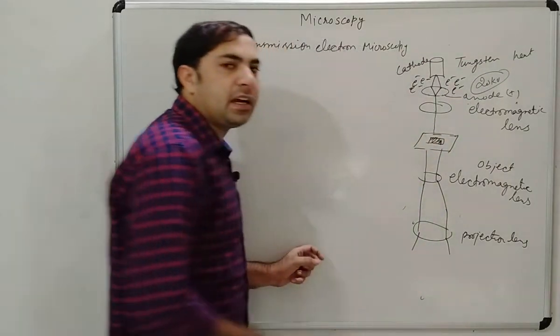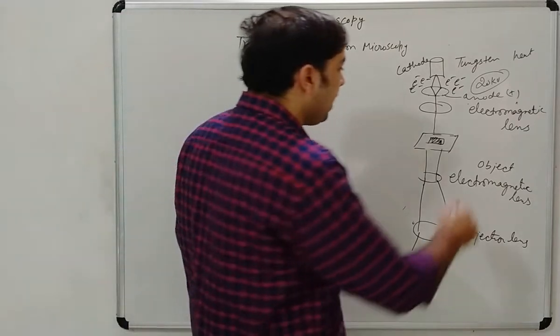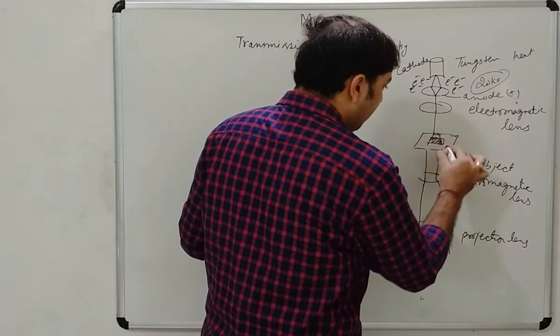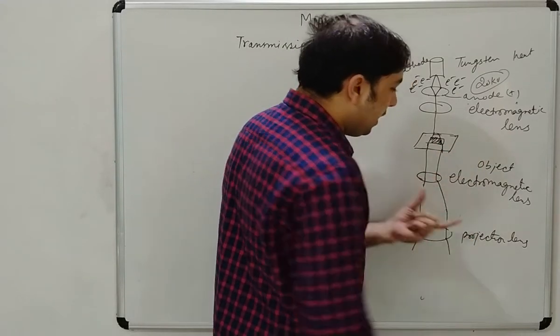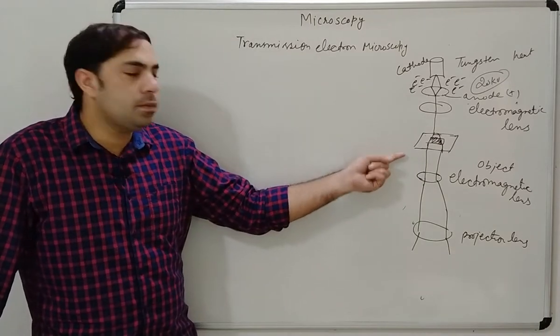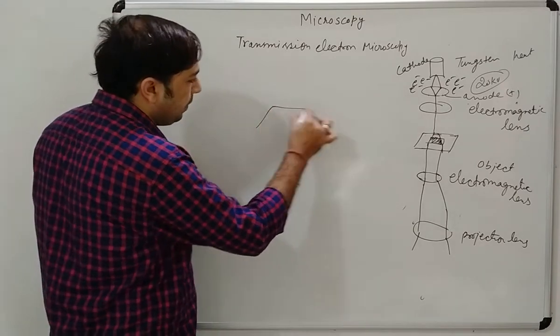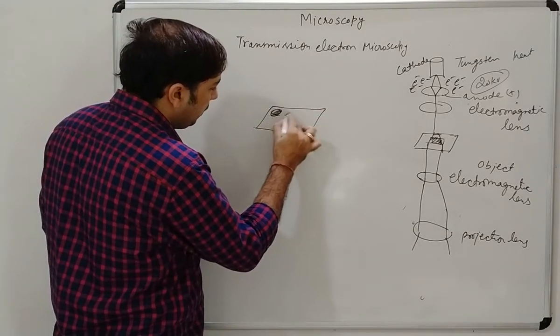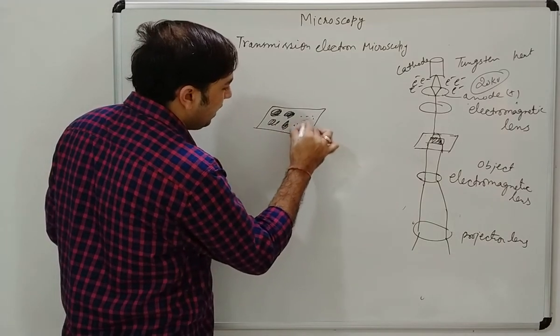Here you can measure by the computer system. The sample is there. Then the electron is passed from the surface. Then the electromagnetic lenses observe this system, how they will measure the electron system in this sample. Big particle size and small particle size are there.